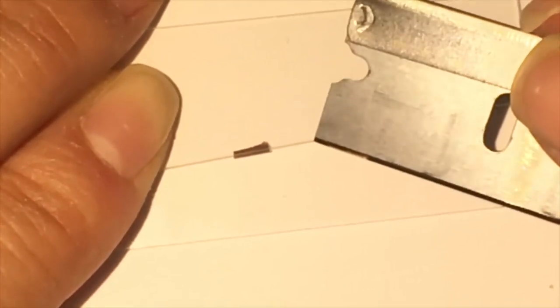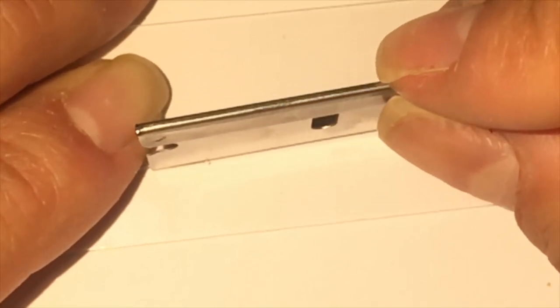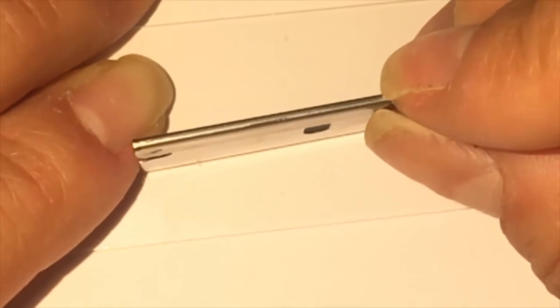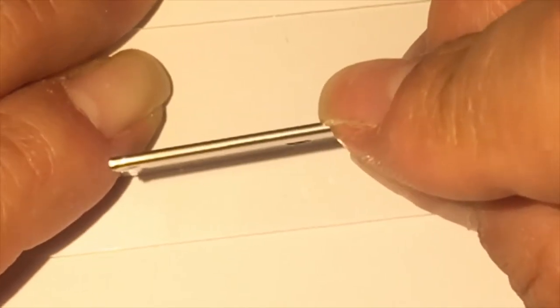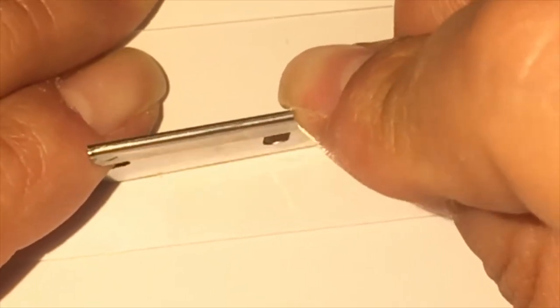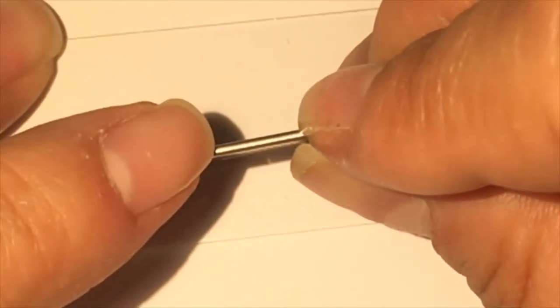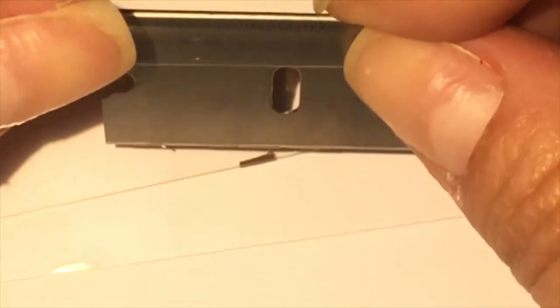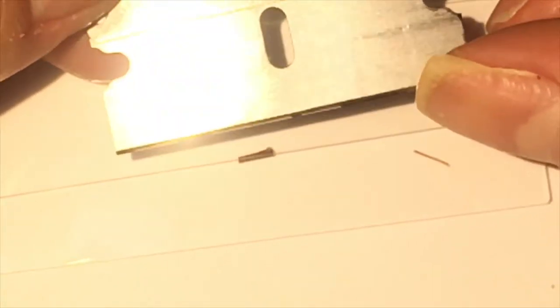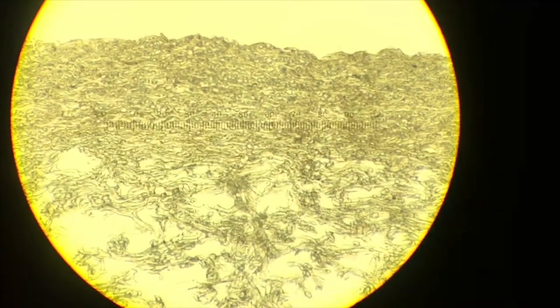I know it's right there. I'm gonna move the blade, and keep moving the blade. Okay, so these are the resulting sections. They're all 1, 2, 3. This is the section that I do like.